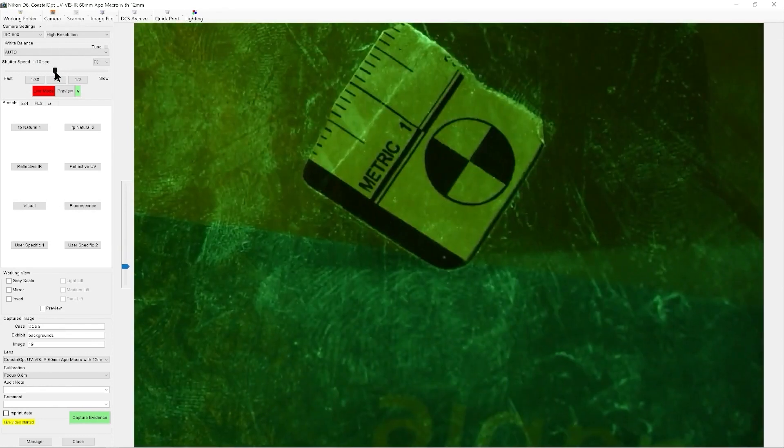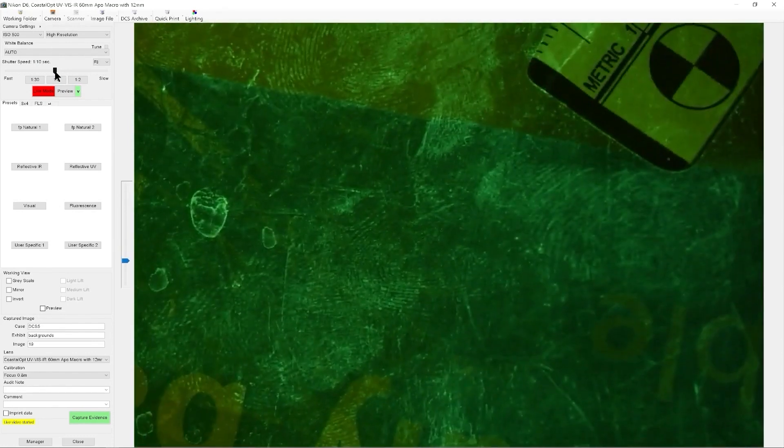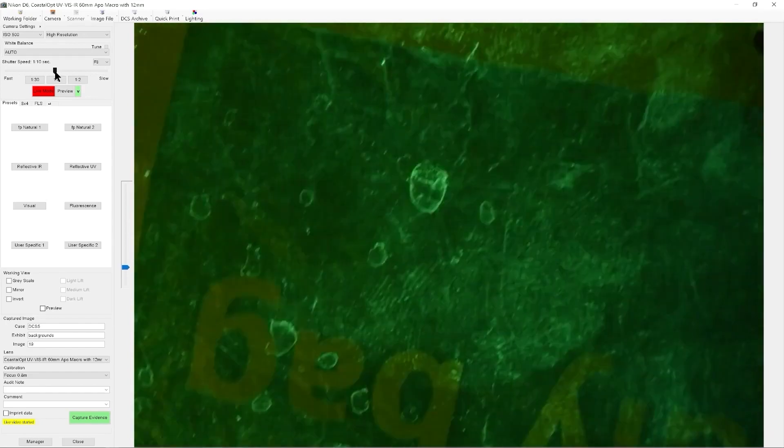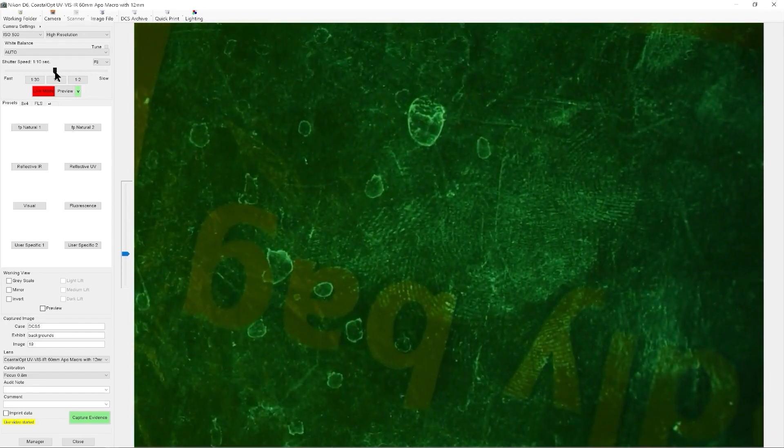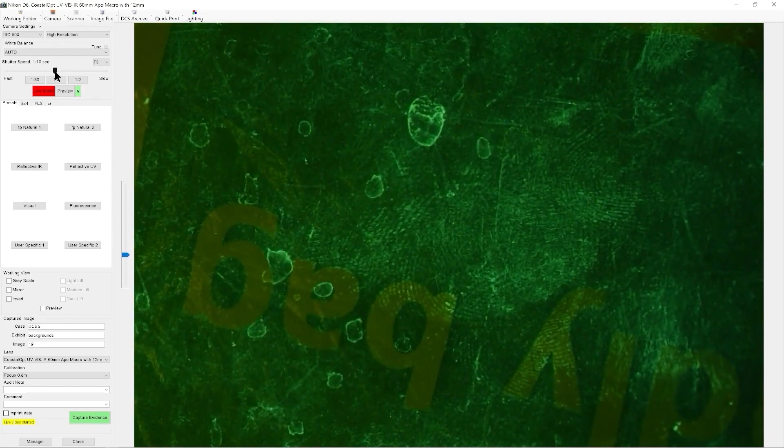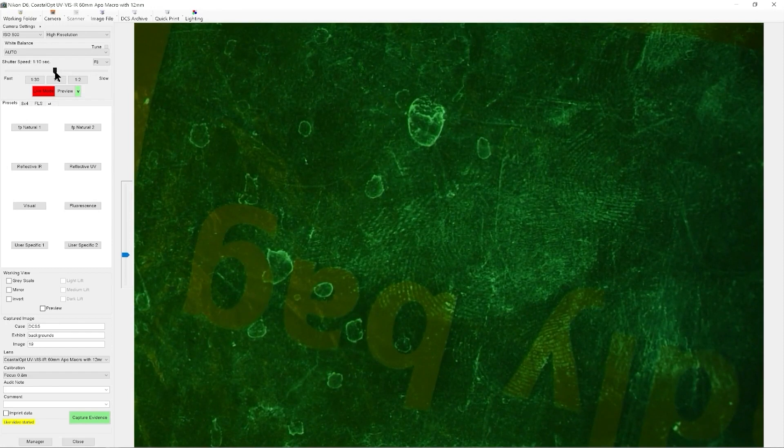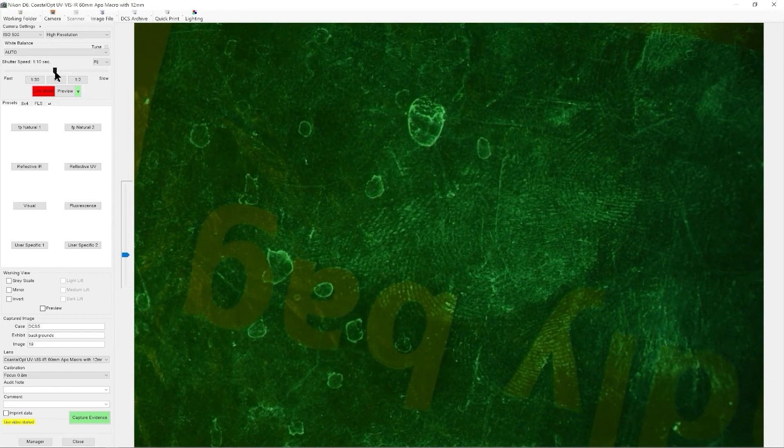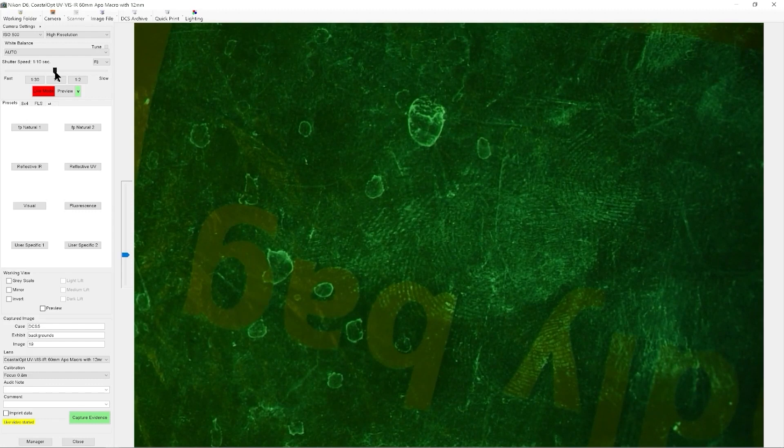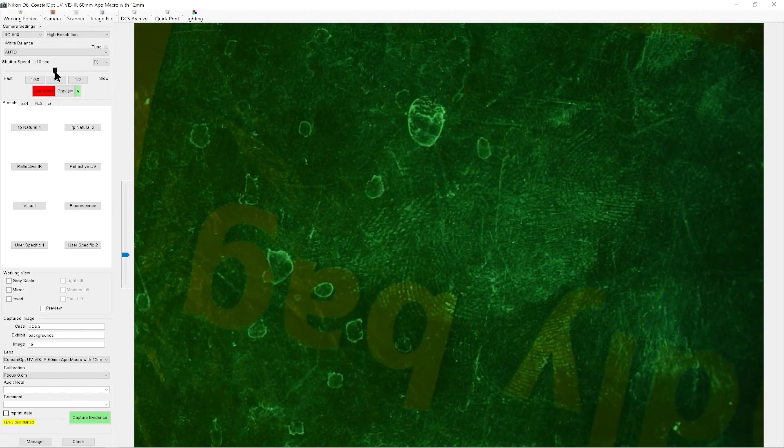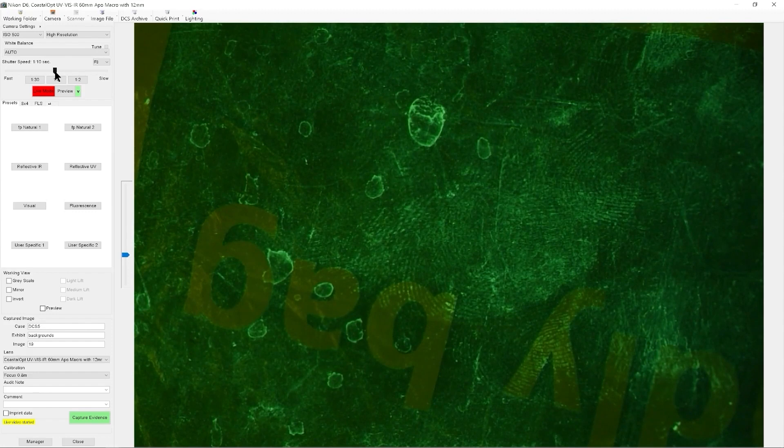If we move this around on my bag, I would be struggling with my eyes to look through goggles now to try and see this fluorescence. Because I'm only going to see in low light from, well really a little maybe from the centre of your eyes. From the corners of your eyes is where you see the most in low light conditions.